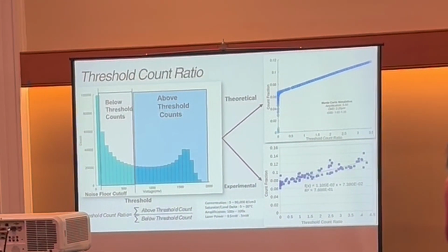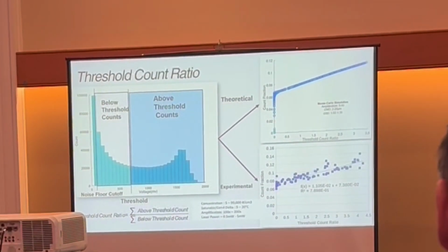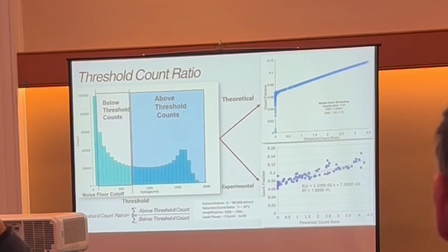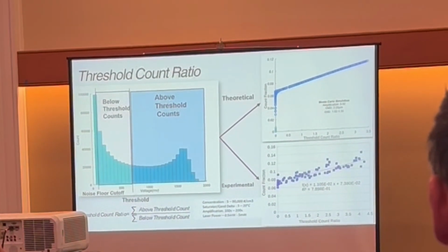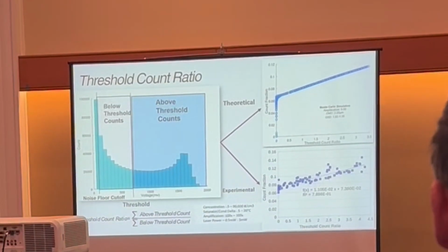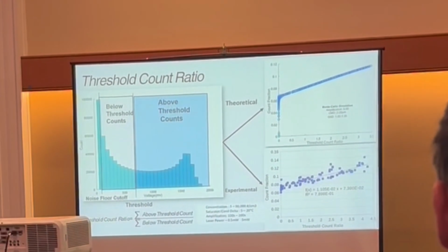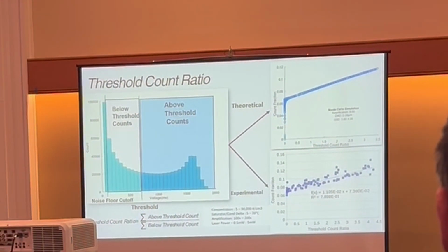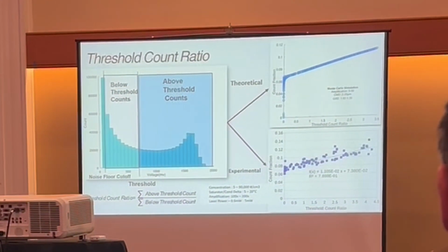I worked on a theoretical model in Octave, which is an open source version of MATLAB, to try to figure out what the count fraction would be as you change particle size. So I created a Monte Carlo simulation where I changed the gain, the amplification, the particle size ranging from 2 to 20 micron, and a large range in geometric standard deviation. As you look at count fraction and use the threshold, it coalesces into a fairly linear line that becomes indeterminate near zero. I didn't believe that data because it seemed way too convenient.